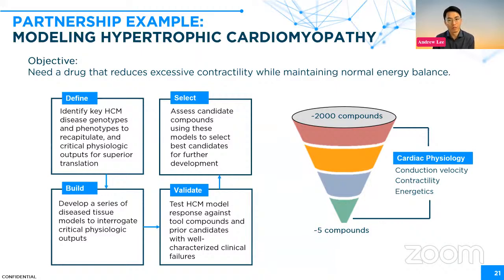But of course, these tissues will never be as high throughput as what's typically used today, which are 2D monolayer cells, 2D cardiomyocytes on 2D monolayers. So we see ourselves somewhere in the medium throughput range, but being able to pick up important pieces of information that translate much better to animal models, and importantly to human physiology. That would be key, being able to take our assays and translate the results into a human response.